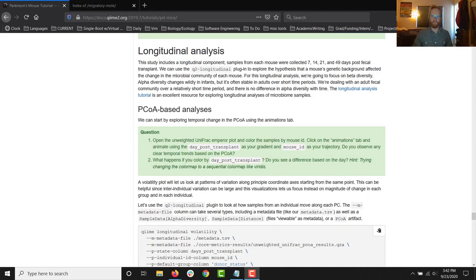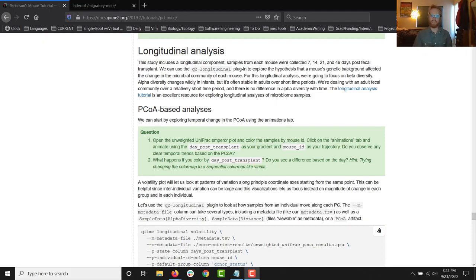Getting oriented — we've come a long way together. Most recently we've been exploring taxonomic classification and differential abundance. Way back, you might remember we ran a pipeline called Core Metrics Phylogenetic from the Q2 diversity plugin, and it produced a whole bunch of different data artifacts and visualizations, some of which — the emperor plots — we've come back to a few times.